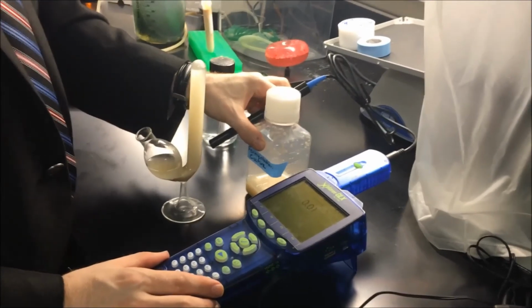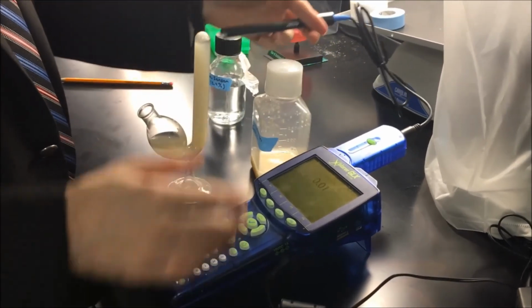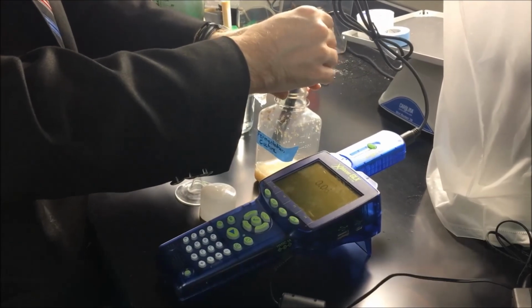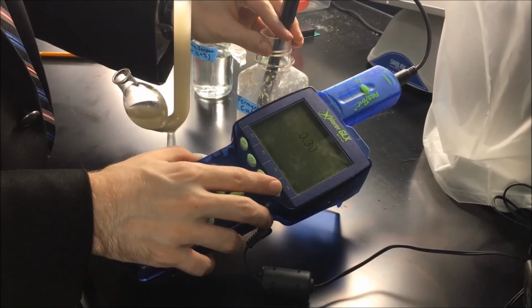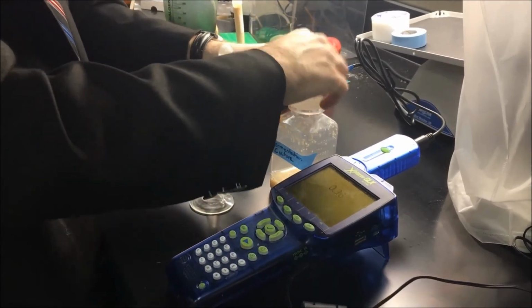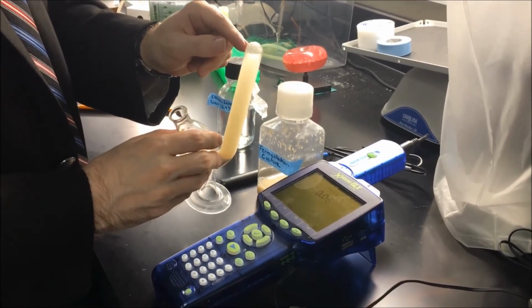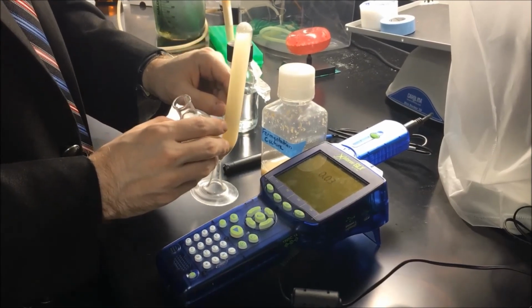You can measure the ethanol production from yeast that is performing fermentation by using an ethanol sensor. So I can open up my culture, stick in my sensor, and then you can see that the percent of ethanol is increasing. Alternatively, I can use a fermentation tube that you see here, and if you look at the top, you can see the formation of bubbles, which indicates carbon dioxide production as this culture is performing fermentation.